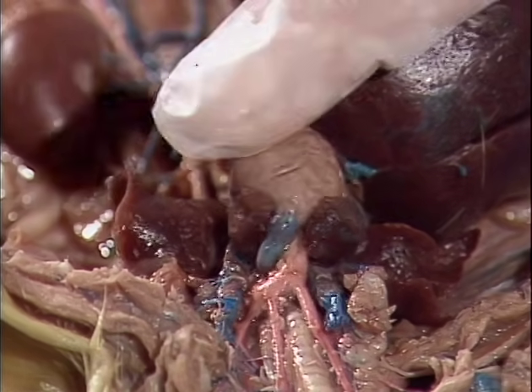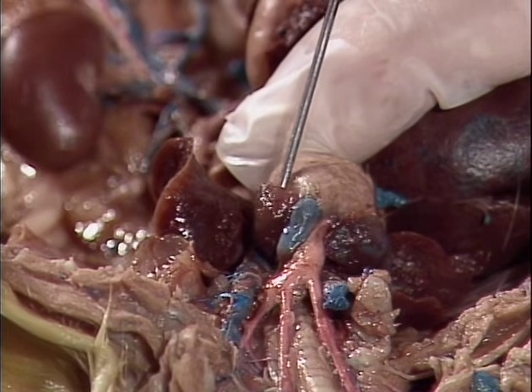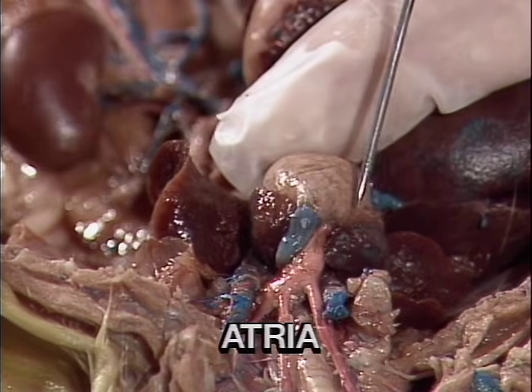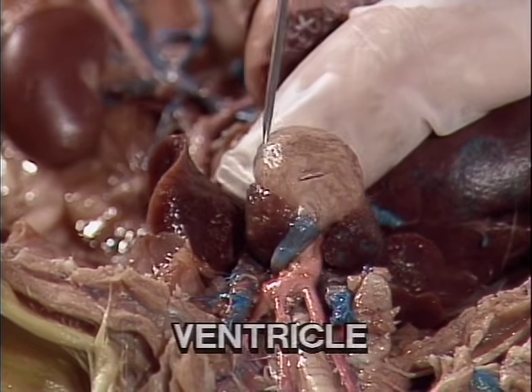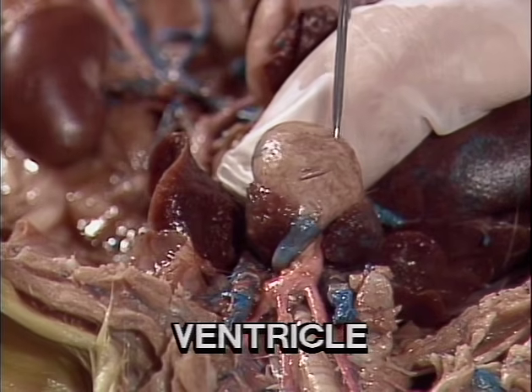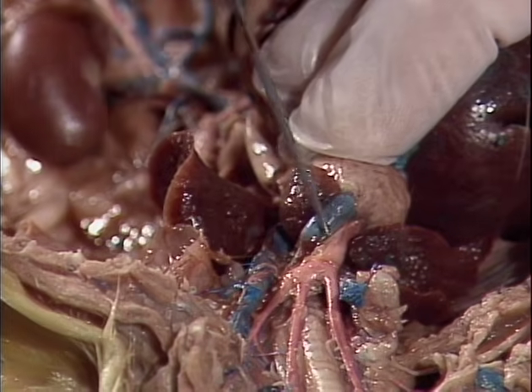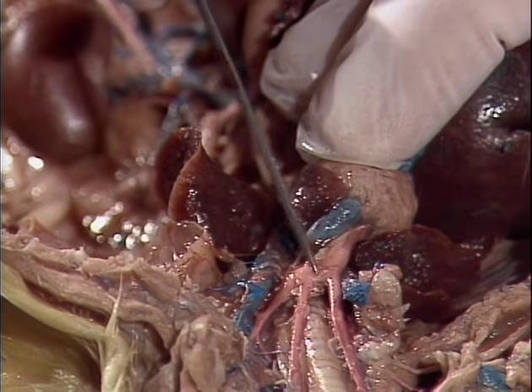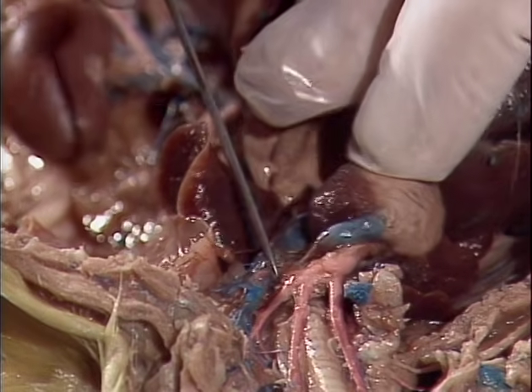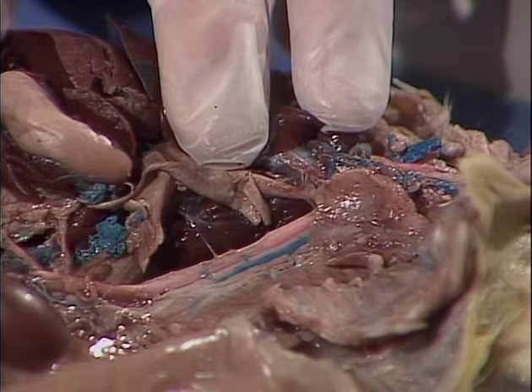This is a four-chambered heart which consists of two flap-like structures known as the left and right atria, and two muscular ventricles, the left ventricle and the right ventricle. Leaving the left ventricle is a large pink vessel which curves towards the rat's left and then bends and goes down towards the tail of the rat.